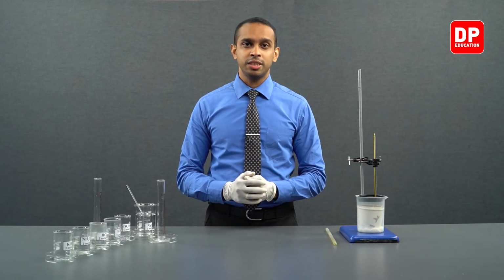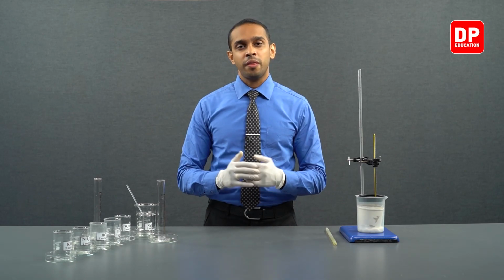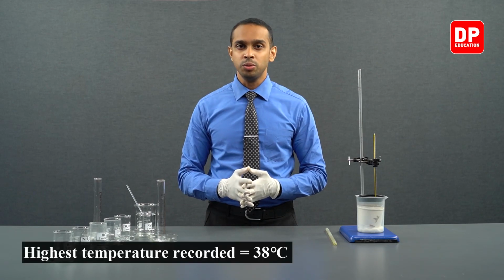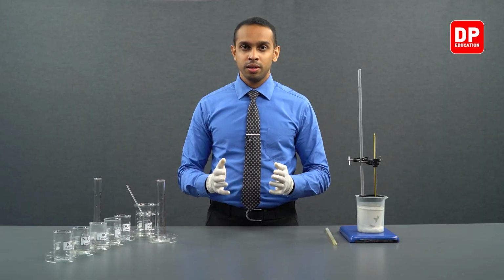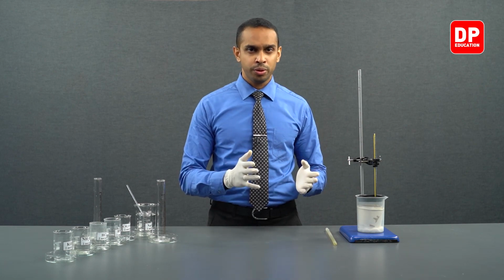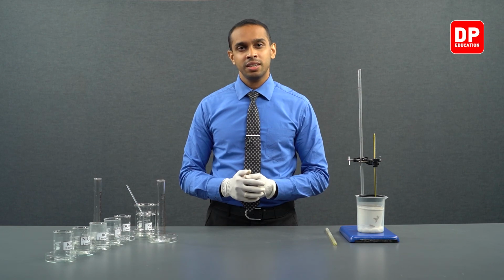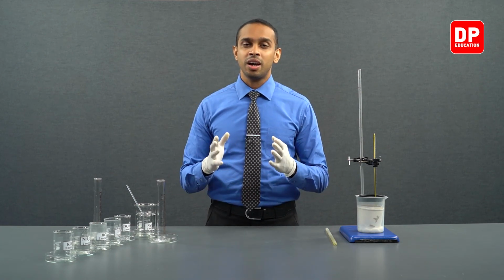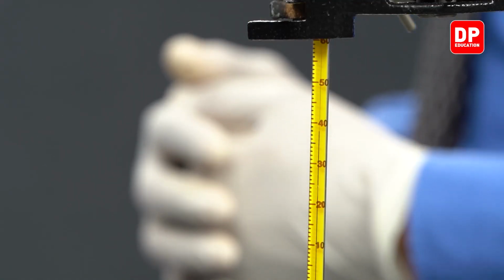After allowing the reaction to run for a while, we observe the highest temperature that the system reached. The highest temperature that the system reached was 38 degrees Celsius. Now, we have to note down the initial temperatures of the solution. Both of the solutions were at 26 degrees Celsius. Now, after the reaction has gone to completion, the highest temperature that we recorded was 38 degrees Celsius.